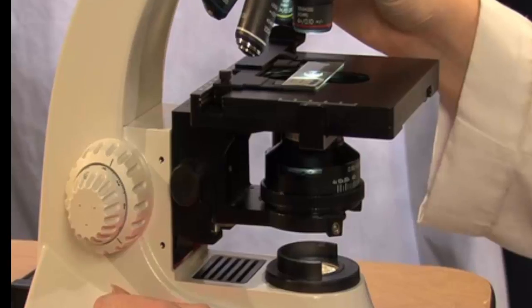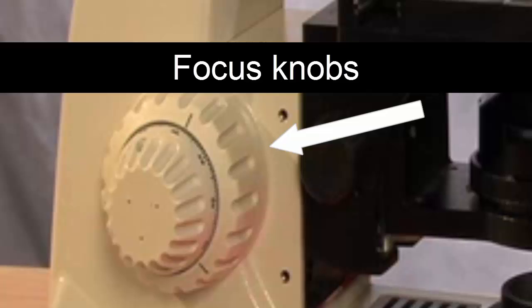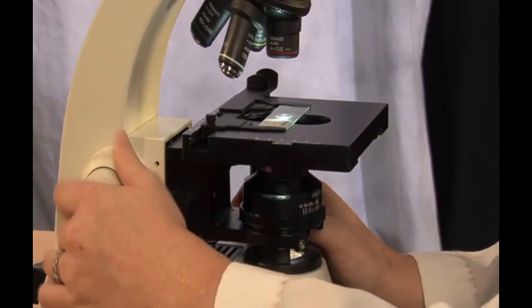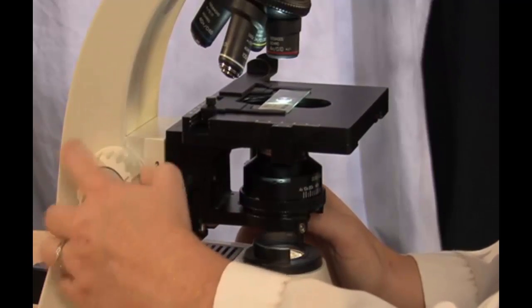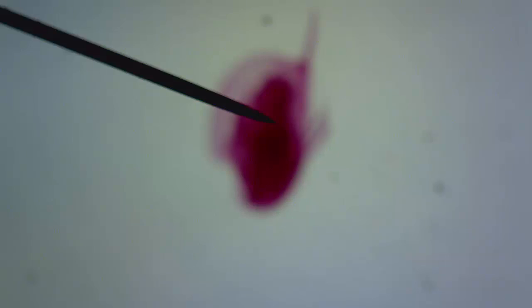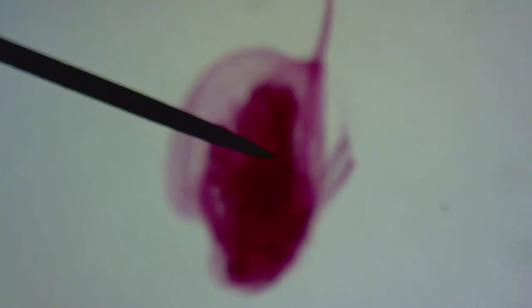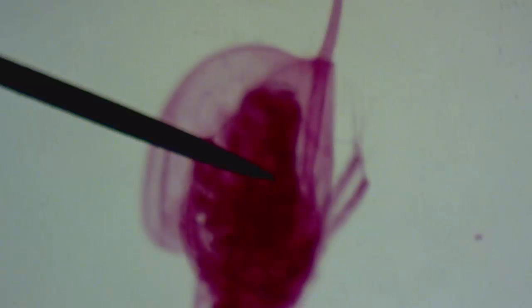Now, we will move to the focusing mechanism, which consists of two knobs. The outer knob is the coarse focus knob and when you turn this knob, the stage moves quite a bit. The coarse adjustment knob is for bringing specimens into focus and should only be used at the lowest magnification.